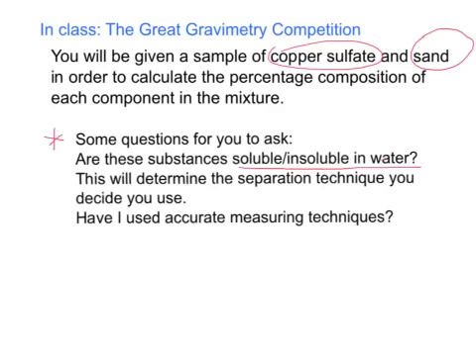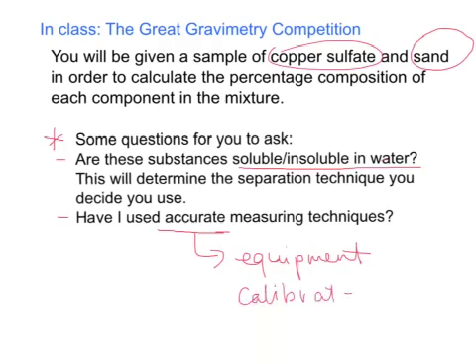The other question I want you to ask is, have I used, or will I be using, accurate measuring techniques? So making sure that we're taking measurements using the correct equipment, and that our equipment is calibrated correctly. So when it gives you a value, is it that actual value? I want you to have a look around the term calibration and do a bit of research on that, all that sort of stuff.